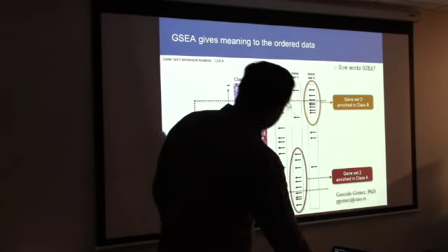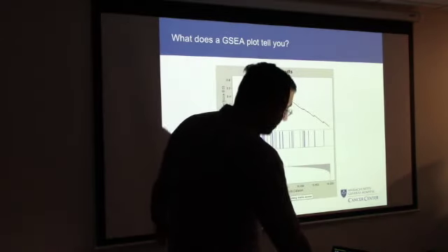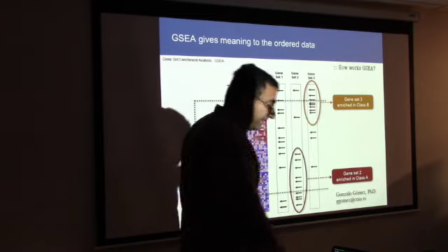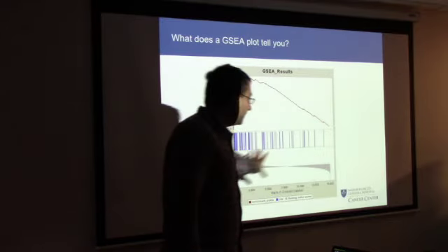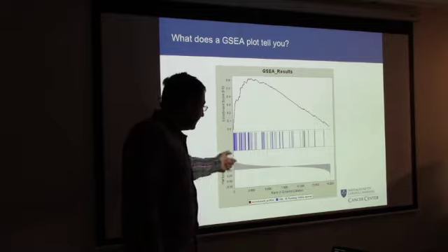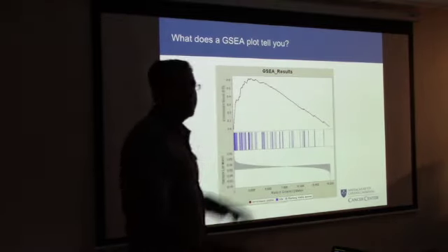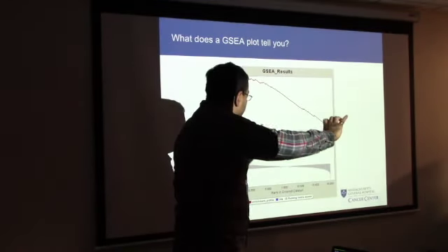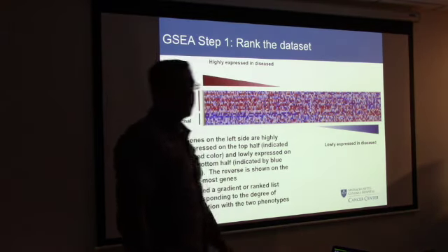So those bars, the blue bars, are the position of the genes. Except now, instead of looking at it vertically, this thing has been flipped 90 degrees and is now horizontal. Here is your expression. These are your samples right about here, and these are your genes now. So the whole figure, instead of being vertical, is flipped 90 degrees, and what you're seeing here is that flipped version.